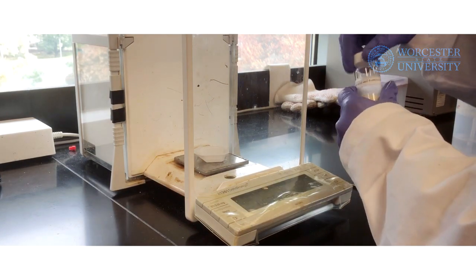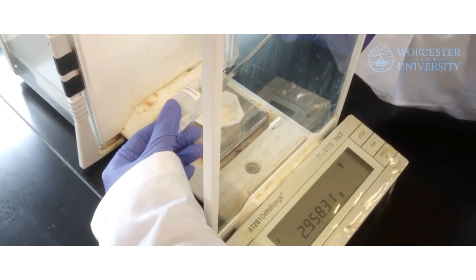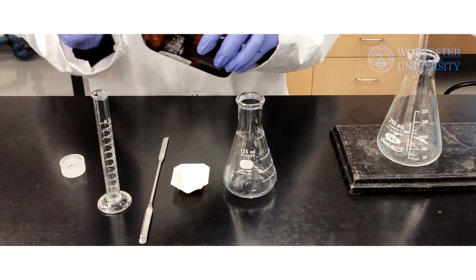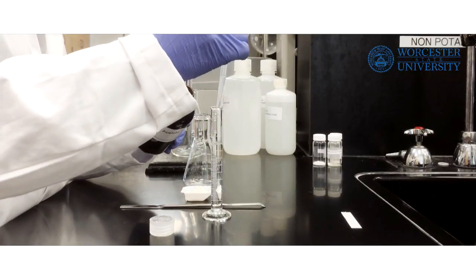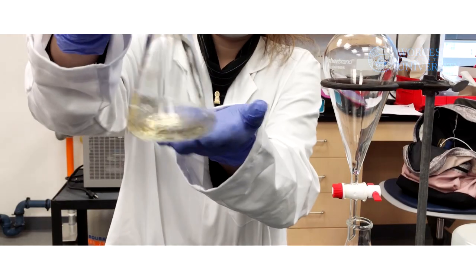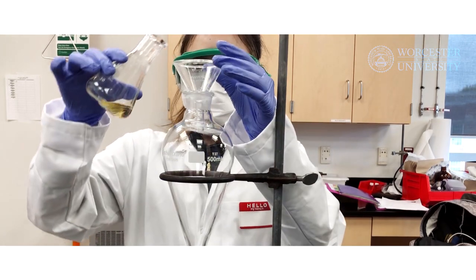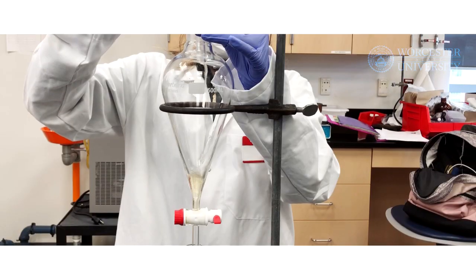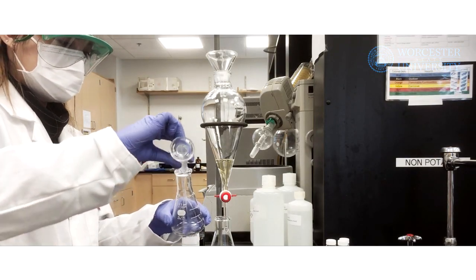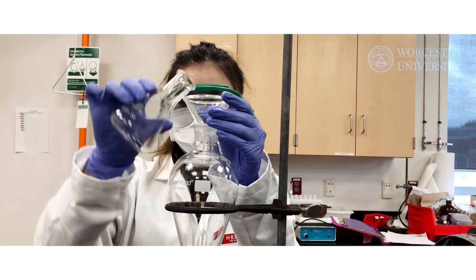First, we will need to weigh out about 3 grams of the unknown mixture of benzoic acid and 4-aminoacetophenone. Then, measure out about 10 milliliters of ethyl acetate using a graduated cylinder. Pour the ethyl acetate and solid into an Erlenmeyer flask and dissolve. Pour the solution into a separatory funnel equipped with a ring stand and ring clamp. Rinse the Erlenmeyer flask with 2 milliliters of ethyl acetate three times and pour into the separatory funnel. You are now ready for your first extraction.